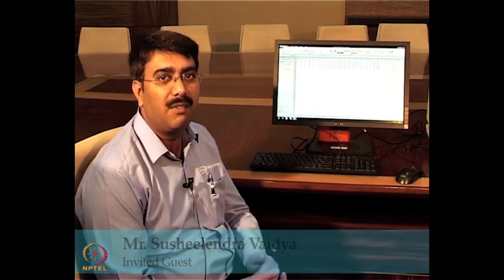Now we successfully demonstrated the protein-protein interactions here, with protein A and the mouse monoclonal antibodies we used. We got very good data with a 1:1 binding model with affinity around the 1.7 nanomolar range. So with this I am concluding my demonstration.